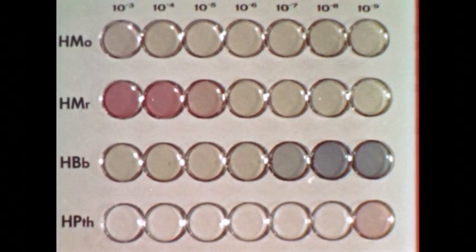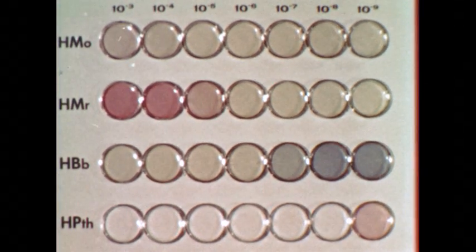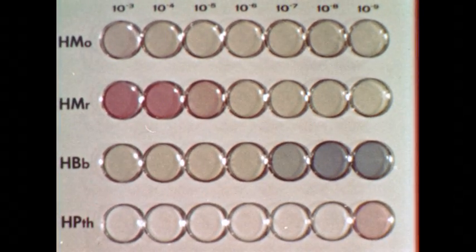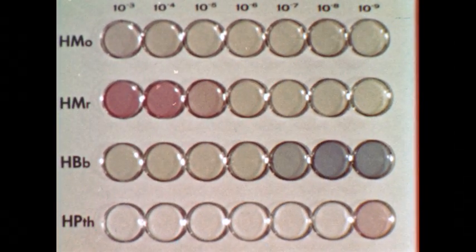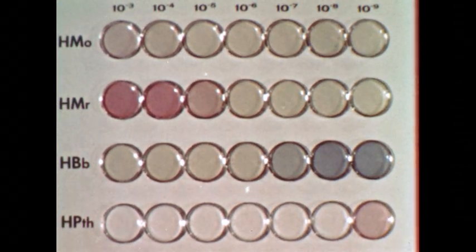Here we have all 4 indicators. Each horizontal row shows the color of one of our 4 indicators as the acidity varies from 10 to the minus 3rd molar to 10 to the minus 9th molar. Each vertical column contains solutions of identical concentration of aqueous hydrogen ions.